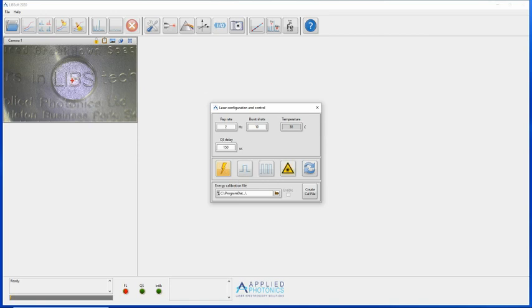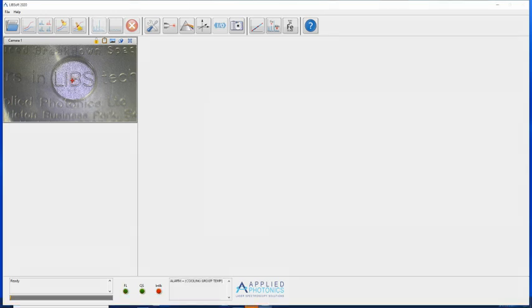Note that some other lasers do not require a reset procedure, but the flash lamp and acquisition initiation buttons will still be disabled until all of the interlocks are satisfied. The remote or external interlock is the most common interlock error that is displayed during operation of the laser.